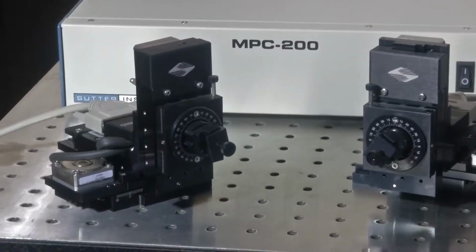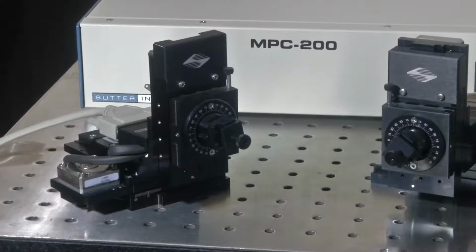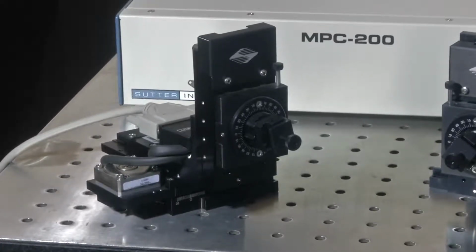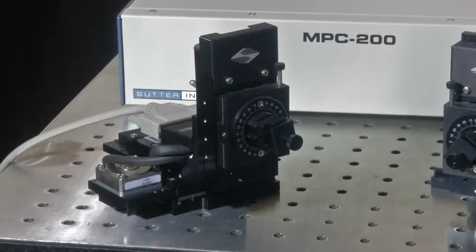Now that we have seen how these manipulators can be moved in each direction on a micron scale in X, Y and Z, it gives us a fine control over movements in all 3 directions.